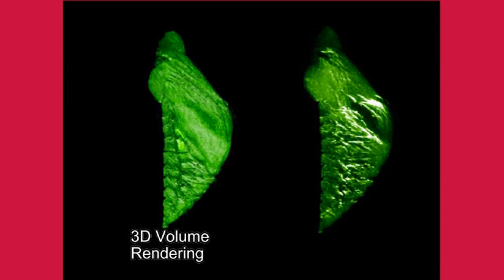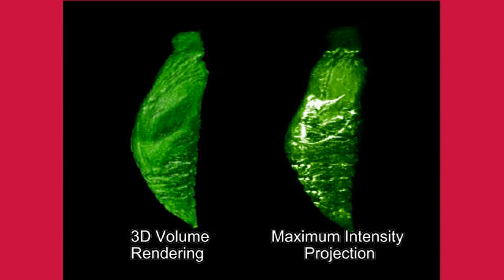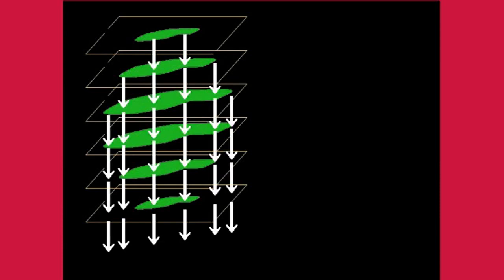The former is a method of integrating the density of objects in front of the line of sight and generating a translucent projection image, so that the appearance of the subject can be seen. The latter is created by selecting and superimposing only the part with the maximum signal strength in each of the captured cross-sectional images, and the inside of the subject can be seen through.